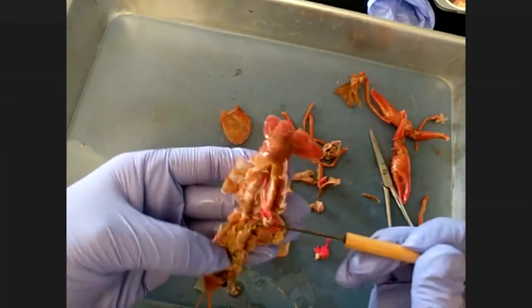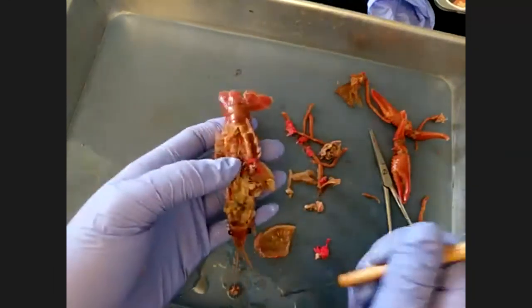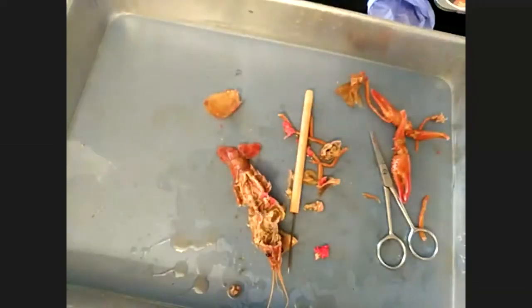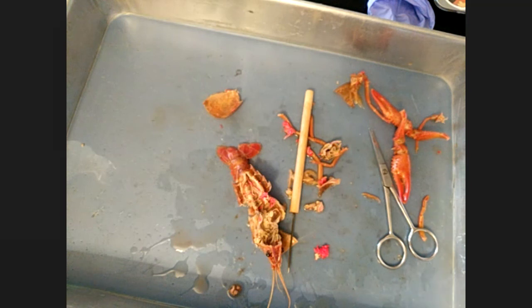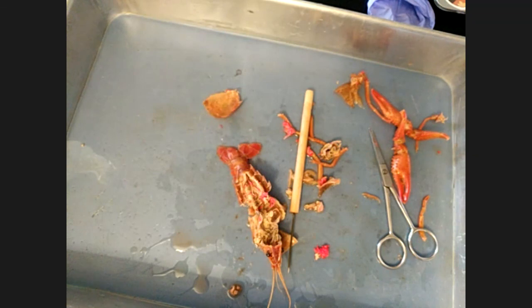And unfortunately, I cut through them, but usually right before the tail are the gonads. What are gonads? For both male and female, they're the sex organs. So right before the tail, that's usually where the gonads are. They're used in reproduction, and that, my friends, is the crayfish.